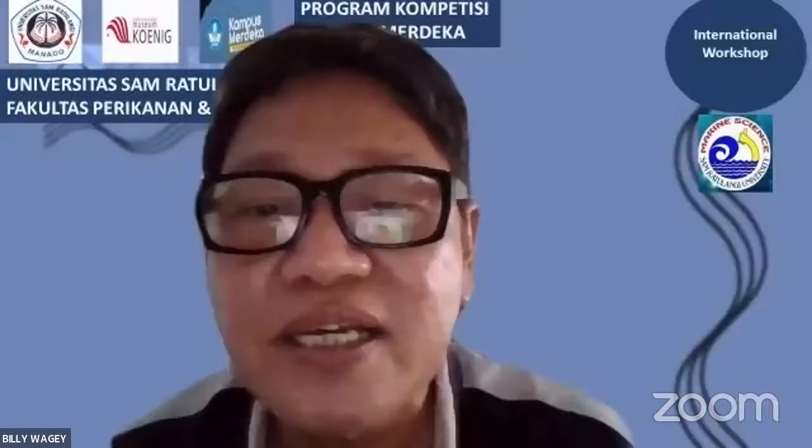We will have the last talk on the 14th, Tuesday, so hopefully next week. And then we will talk about the phylogenetic trees. Because now we have already done the alignment. Yes, you have the alignment. Now the next step is to get the tree.